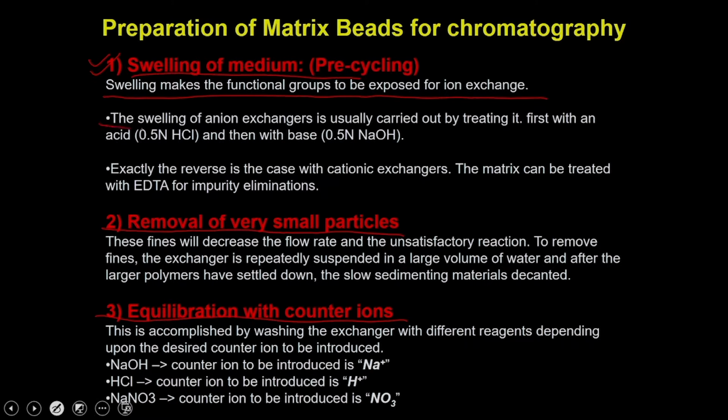For anion exchange chromatography, it is usually carried out by treating with a very mild acid, for example 0.5 normal HCl, and then with 0.5 normal NaOH. With this treatment, the functional groups present on the medium are exposed and ready for the exchange process.